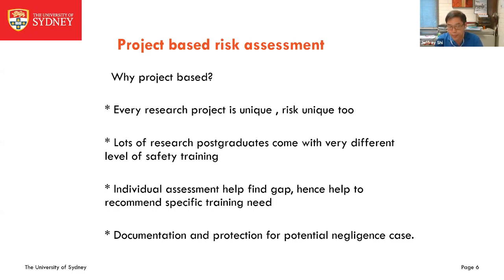Last but not least, project-based risk assessment is also good documentation and protection against a potential negligence case. In the end, all the staff have a duty of care for the students under their care. We do need that type of document and protection just in case. And the work health safety law has all sorts of requirements.